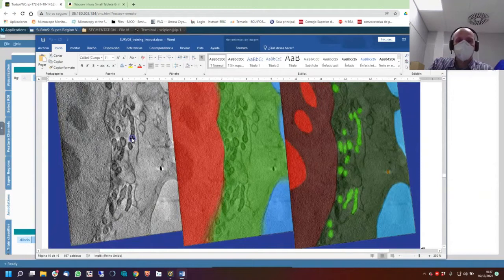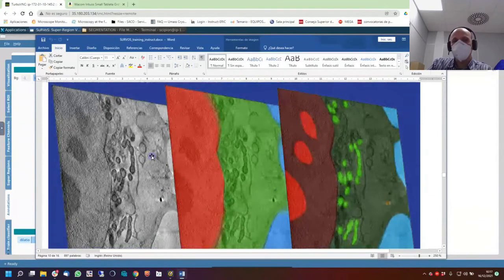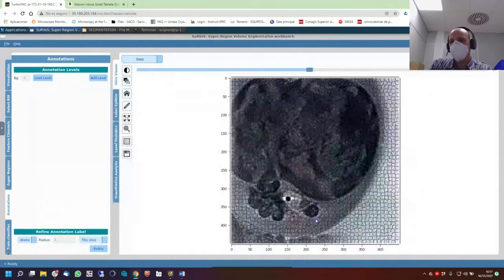And how to do with that? Because otherwise, if you select cytoplasm and then create another mask for mitochondria, the mitochondria selection will erase the cytoplasm selection, and we don't want that. To avoid this problem, we can create different layers or levels. So if we are going to select cell, cytoplasm and nucleus, we can have cell, cytoplasm and nucleus, and then the organelles in 3 levels.